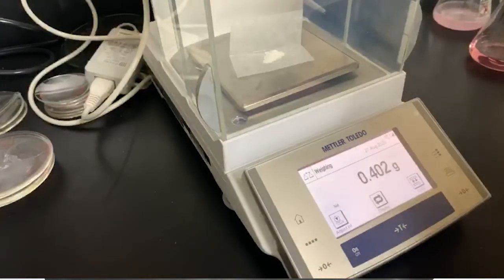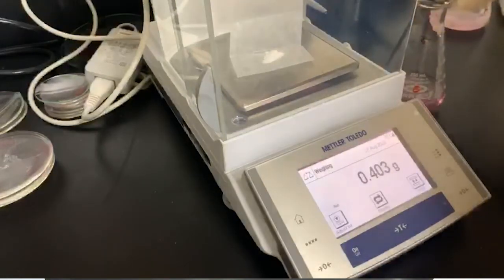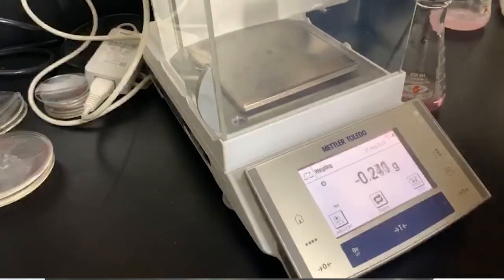And record your mass. And we'll put that into this Erlenmeyer flask here that's marked with the letter C.